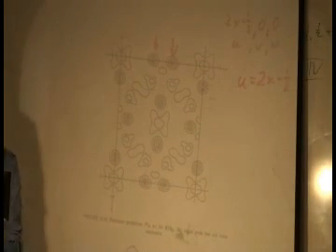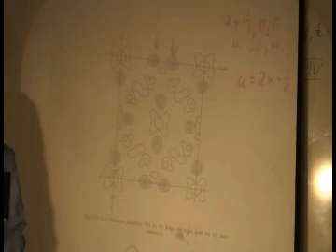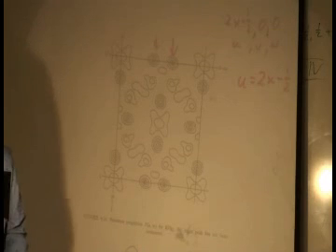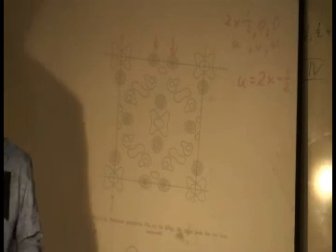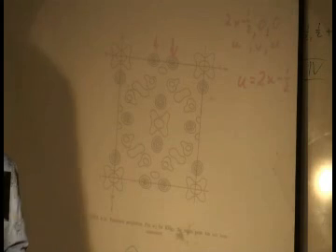And which of these 2 we take really doesn't matter. Remember, we have more than one atom in this unit cell. Which one we find first and then generate the equivalent ones really doesn't matter. But it's these peaks that we have to take. So, how do you do it? You use a ruler and you plain old-fashioned measure.